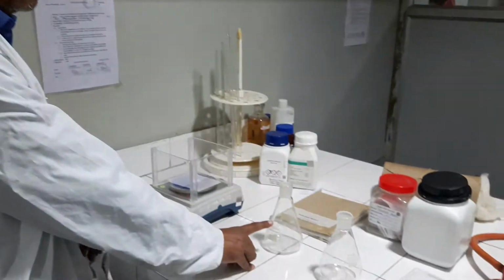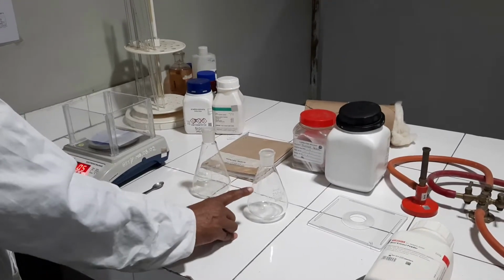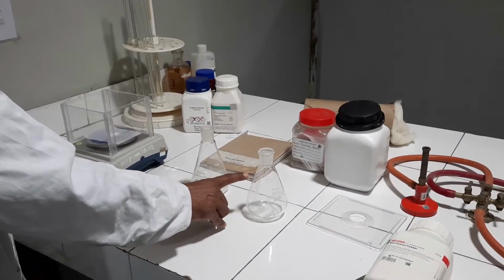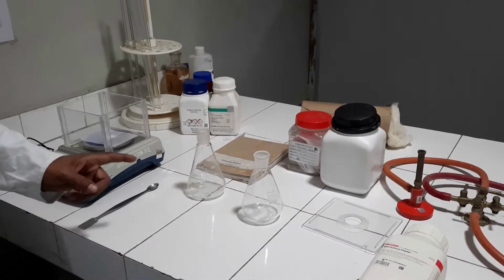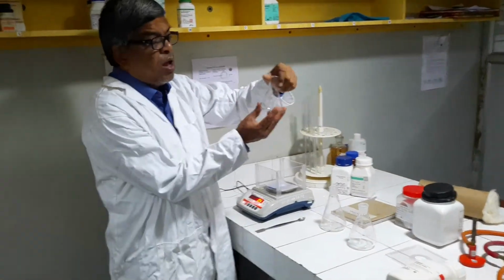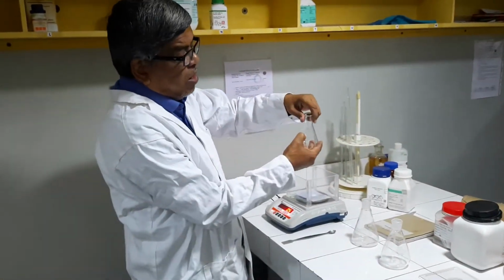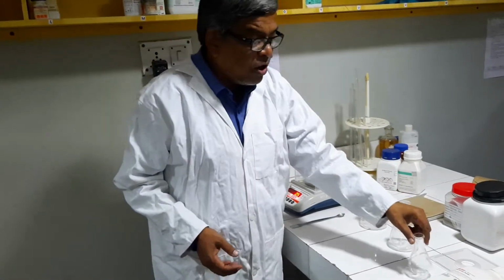This is conical flask number 1 for liquid media. This is conical flask number 2, marked with a label, for solid media. We are going to prepare 100 ml, right? But I am not taking a 100 ml conical flask, where this 100 ml mark is up to here.